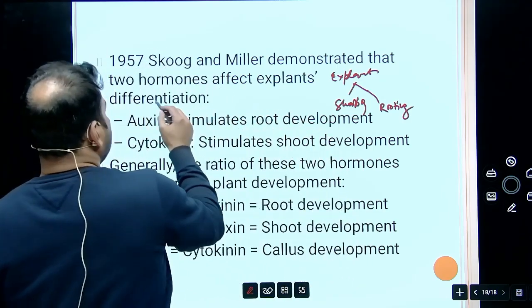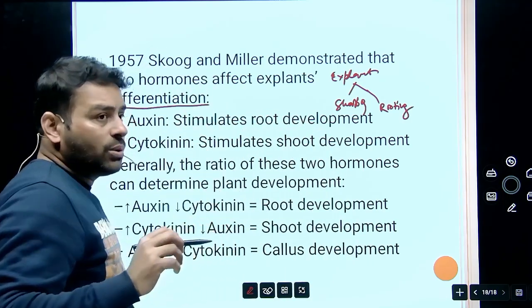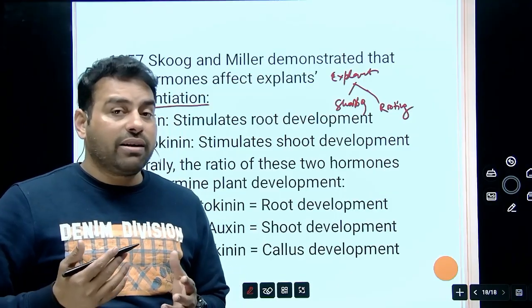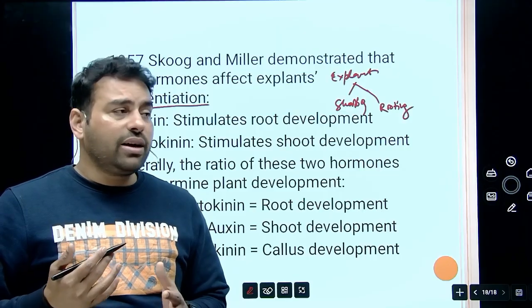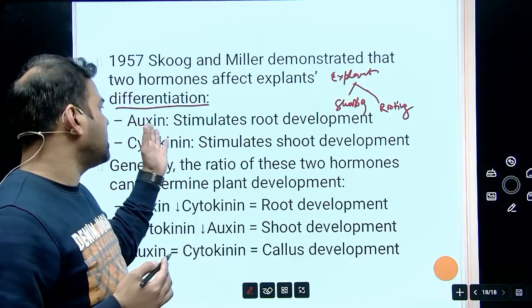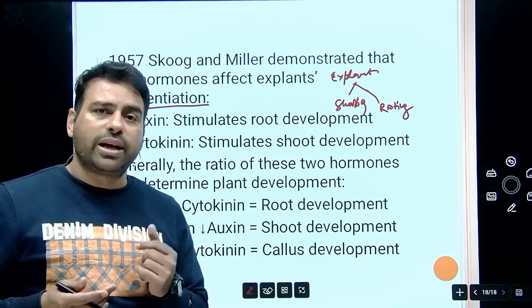But by customizing these hormone requirements, we can customize the differentiation according to the need.